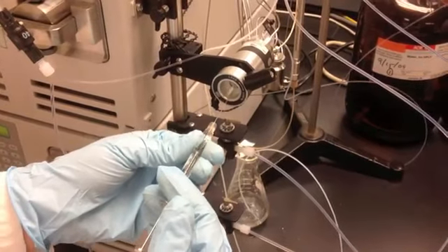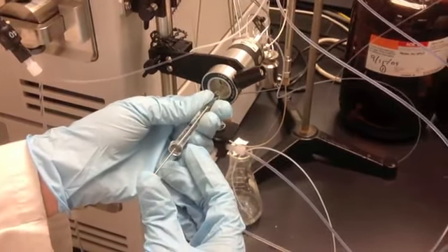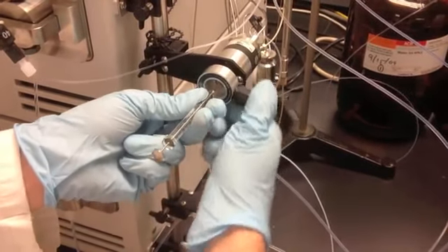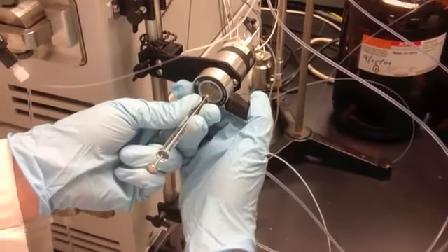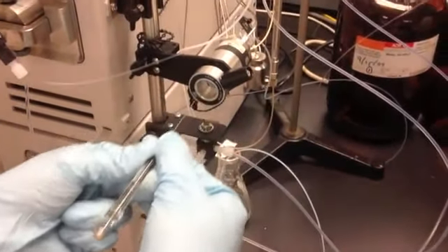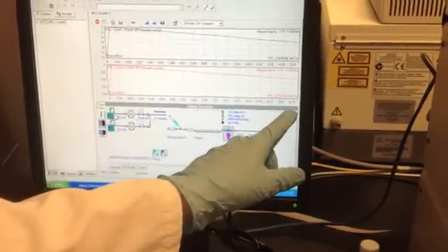To run through it, push it in until it breaks. Put our sample in. Now, down. One, two, three, four, five. Up. Remove. If you'll come right over here real quick, you'll see that the machine is now reading, and it's running.